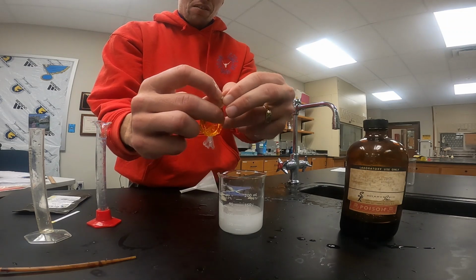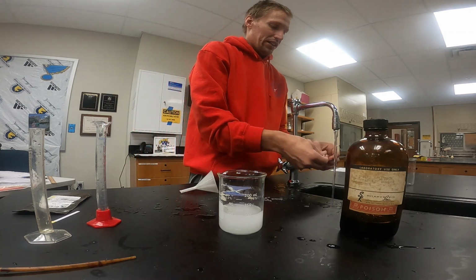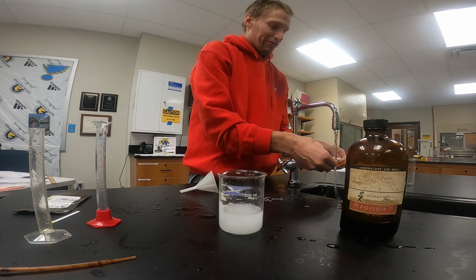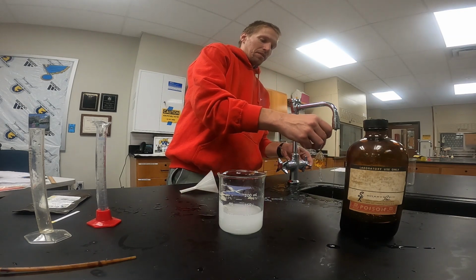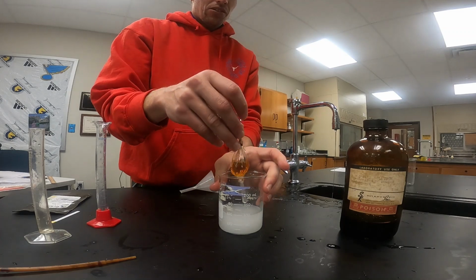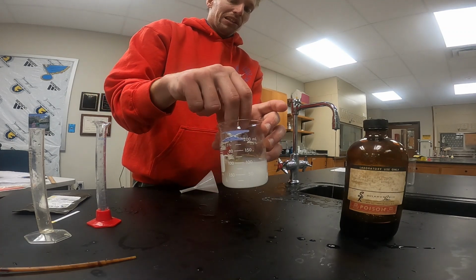So tie it off, rinse it off in case we got anything outside the bag. Make sure we remove anything that got spilled outside the bag. And then we'll drop it in our beaker, and we'll leave it to sit in that solution for about 20 minutes.